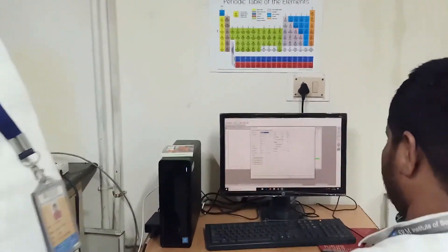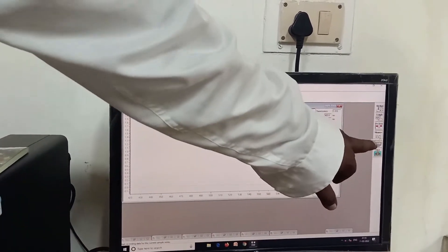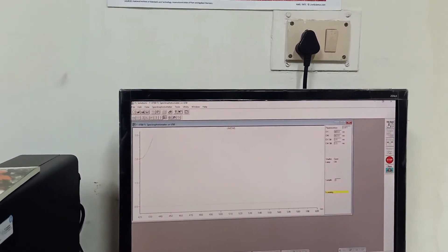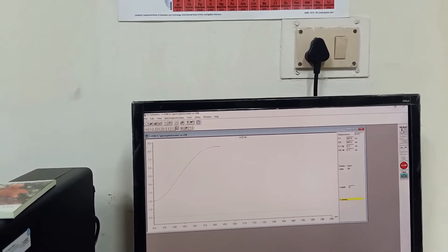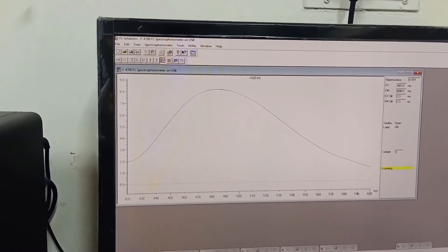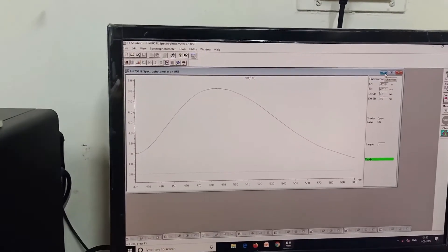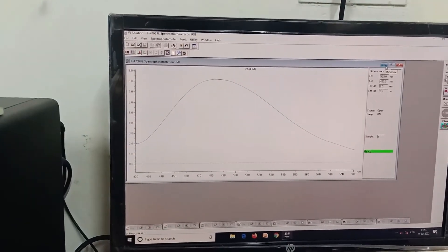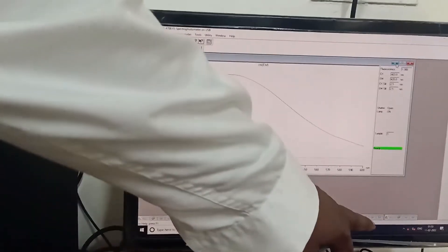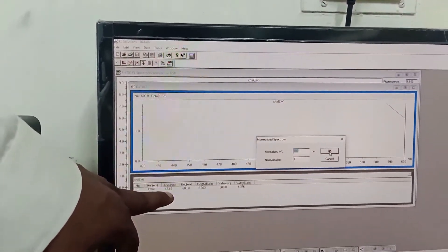You can start the measurement. You can see that the instrument gets ready, and when you get the ready signal, you can proceed with the measurements. There is a clear fluorescence and the emission is recorded. When the molecule is excited at 403 nanometers, you will see a peak at around 495 nm. The actual peak observed here is at 483.6 nanometers.